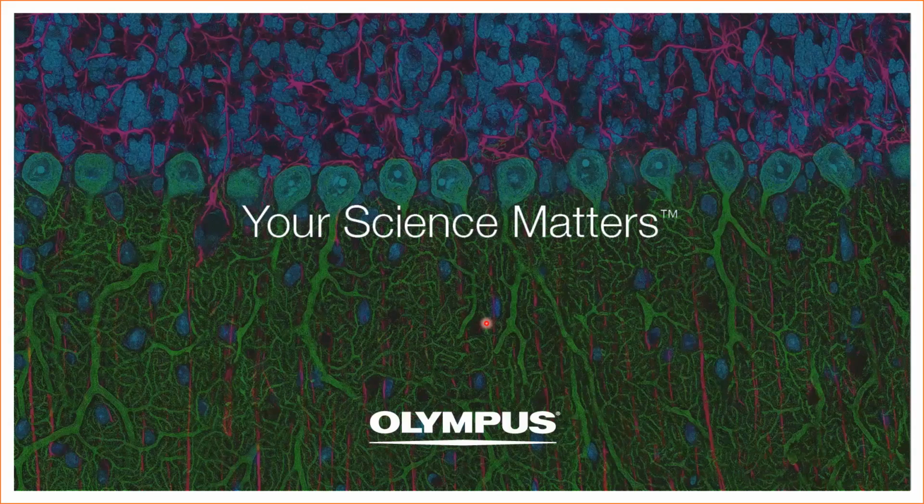So yes, you should absolutely look at what type of media you're using, and then there's other stuff like just general usage. Make sure you're always wearing gloves. Make sure it doesn't get on your hands and doesn't spill over, because it could be really toxic, even to the microscope components. And another consideration is that if you're dipping your objectives into such corrosive media, you might want to consider furnishing caps, which is what we try to do if we have to do that. So those are some of the considerations.